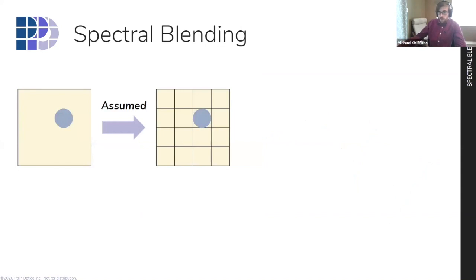Now, there is one downfall in terms of hyperspectral systems. As Priya alluded to, there is the spatial dimension that the sensor is looking at. In terms of the system constructions for the hyperspectral images you've seen, these have been at a little over a millimeter in terms of the physical dimension that each pixel on the sensor is seeing.